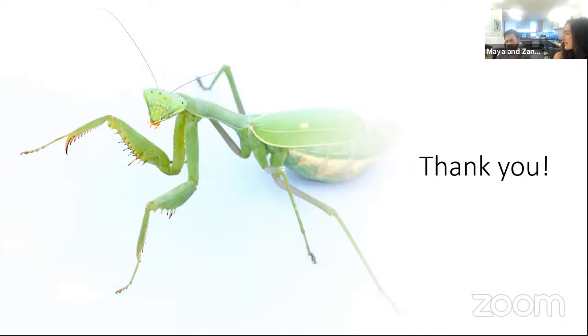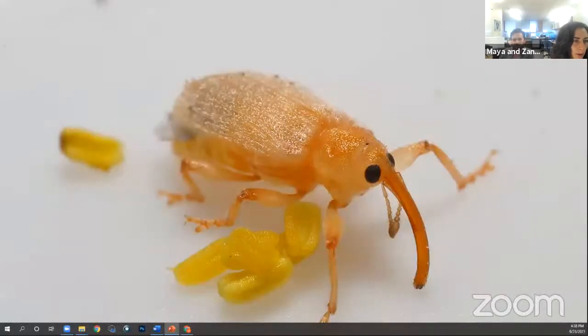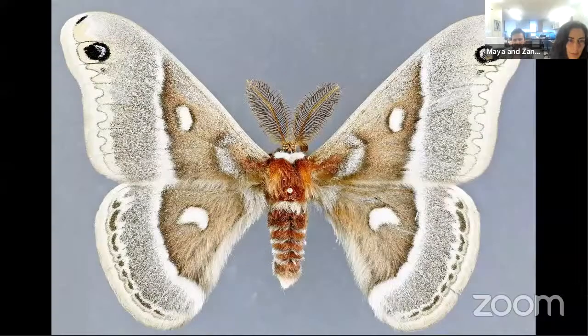That may technically be true because we do macro photography with some of our other cameras that are not on focus stacking rails. And so we're able to increase the theoretical size of the specimen that way, photographing it either in the lab, live, or in nature. But really you're not gonna find an insect that's a meter long. If that was on a slide, it must have been a typo. That may have been true in the Paleozoic, but these days we're fortunate, they're a little bit smaller.